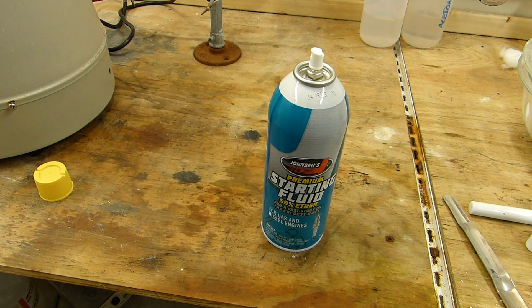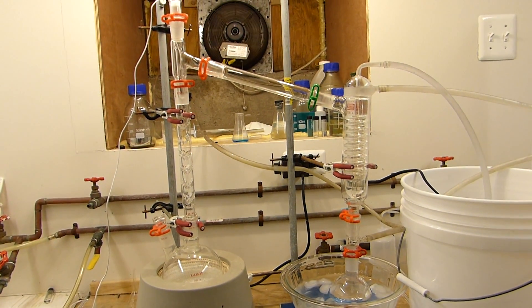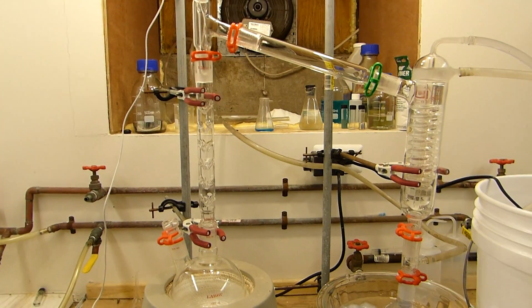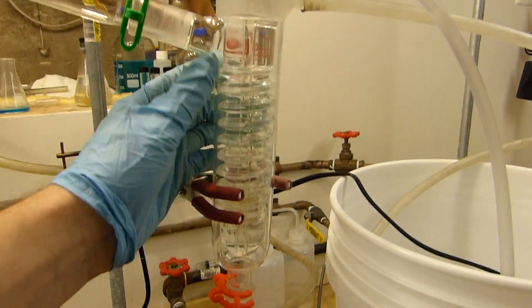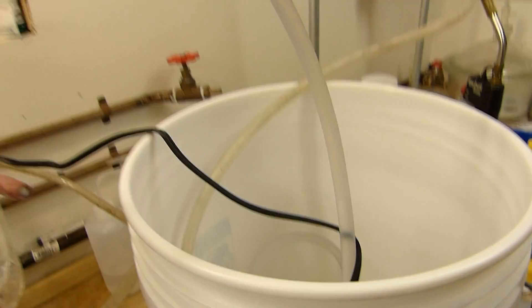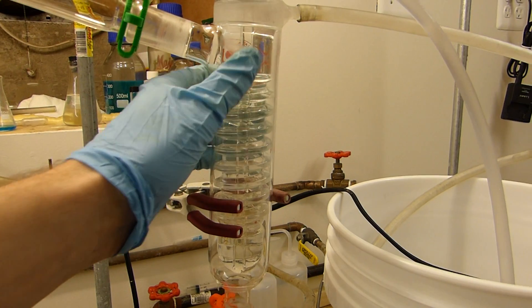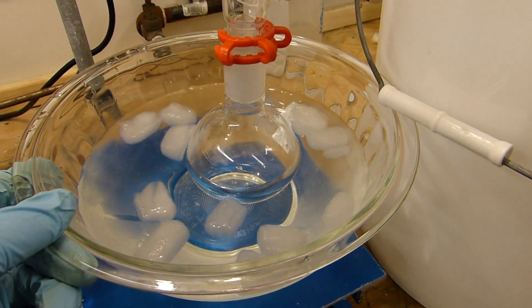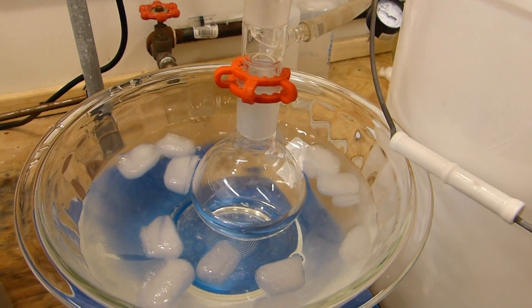I've set up for fractional distillation — same as simple distillation but with a column in place to help separate compounds with close boiling points. I've chosen a Friedrich's condenser because it's fairly efficient, and I've got ice water running through it, which is colder than standard tap water. I need ice water especially because diethyl ether has such a low boiling point. I also have a bowl of ice water surrounding the collection flask, which prevents ether from escaping and maximizes yield.